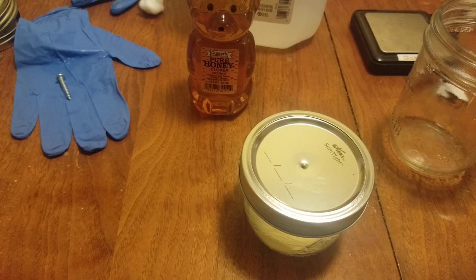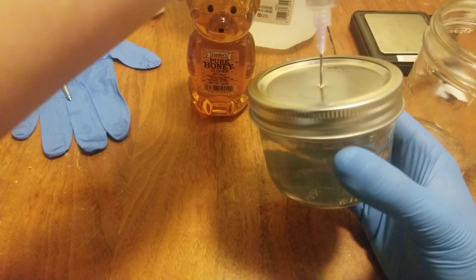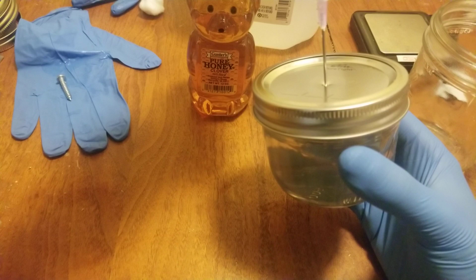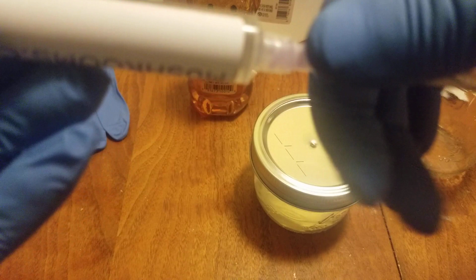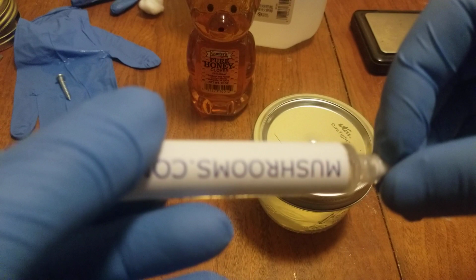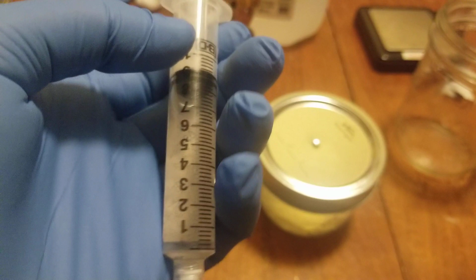So let's just start right in. No more stalling. Stick it right in. And push. Perfect. And of course, I'm going to keep this needle for later on, so I'm just going to seal it right back up without stabbing myself. Take this off and grab my plunger. Put it right back on. And there are so many spores in the syringe, I honestly could probably fill it right back up with distilled water. I probably won't. I'll probably use it for various other purposes.